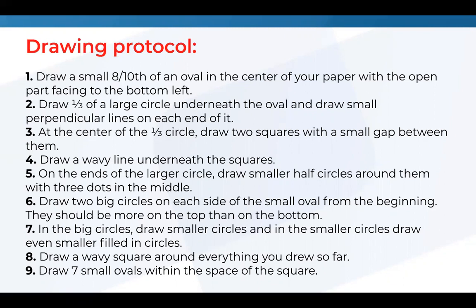It's not a scientific protocol, of course, but it's a protocol to draw an image. If you would like to follow these steps to draw an image, it will be really interesting to see what the results are. So everybody can try to draw an image by following these steps.